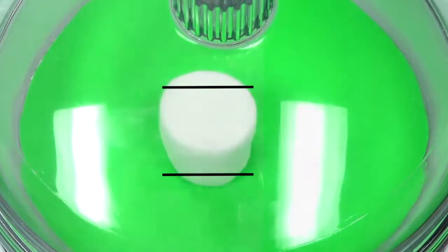The mechanical pump is pretty noisy. As the chamber pressure drops, we can see the marshmallow expanding. Remember, the mechanical pump is what we call a rough pump. It will only evacuate the chamber to a few torr, or remove about 99.9% of the air. So in addition to the rough pump, we would need a high vacuum pump to achieve lower pressures. But the mechanical pump is sufficient for this demonstration.